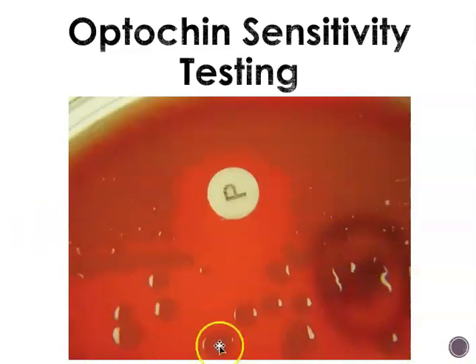A very heavy streak back and forth, side to side, up and down, so that we get a very heavy inoculum of the suspected organism on the plate. We use forceps or tweezers to place the drug disc. They come in a little tube. You pick up one of those drug discs and place it in the center of the area that you inoculated.